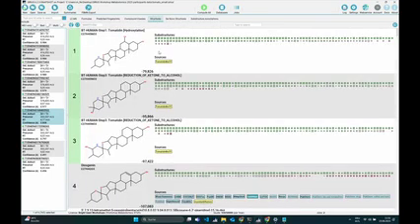What we can see here now is that we have 3 hits which are highlighted in green, which means that these hits are really similar in structure. Because we use this approximate confidence score and not the exact confidence score, we are only interested if the first structure or a variation of this structure is a confident hit.